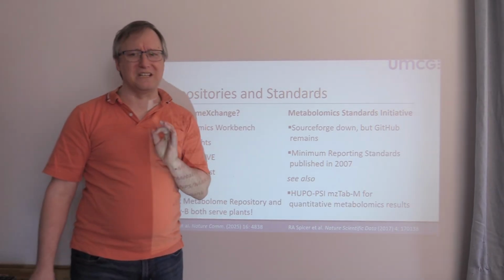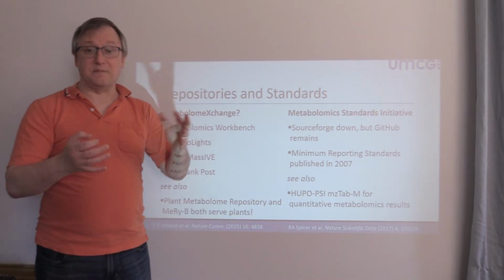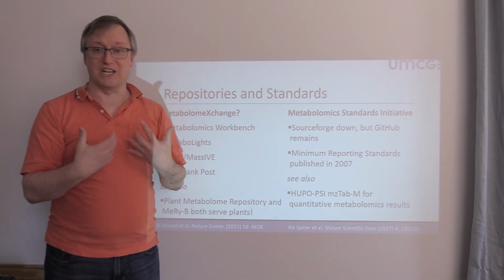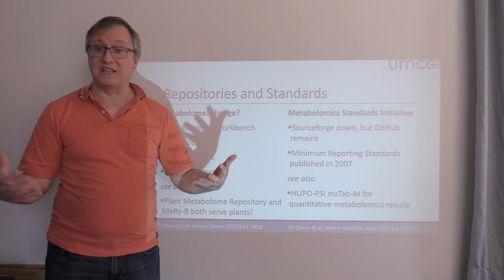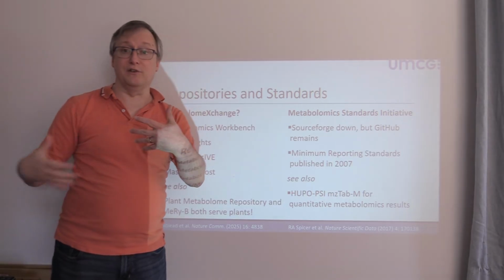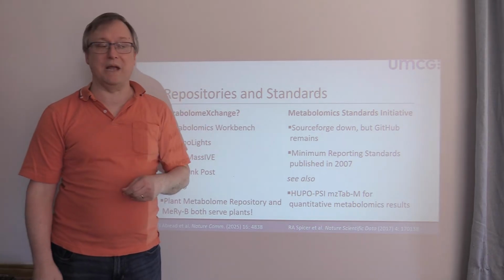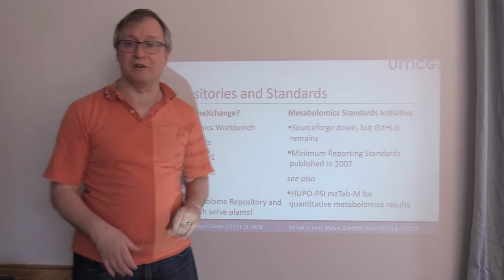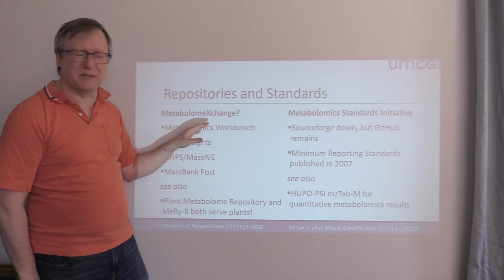Now, I said I was going to talk just a little bit about repositories and standards. I have just the one slide to discuss that. As part of the proteomics community, I've been very grateful for a service called Proteome Exchange, which allows all the different repositories around the earth who work in the space of proteomics to have a shared index system and even to mirror files from some of the other repositories that enable them to download a data set corresponding to a paper. I read a paper in proteomics, there's a PXD number, I look up the data set, I download it. It's great. Something very similar existed in the metabolomic world.